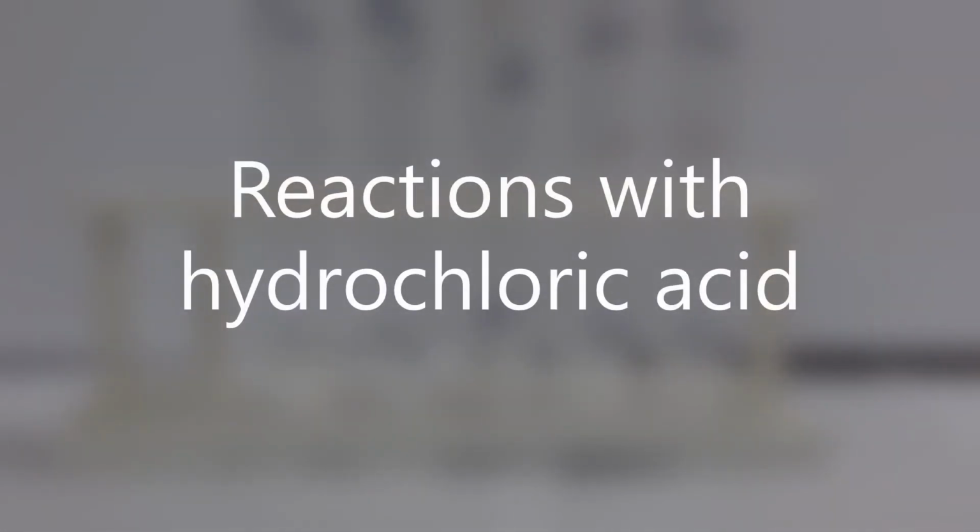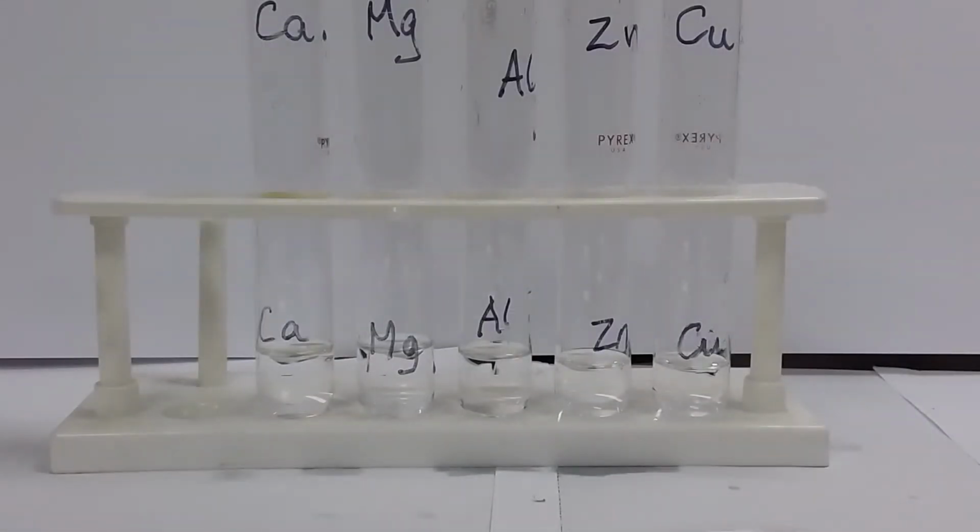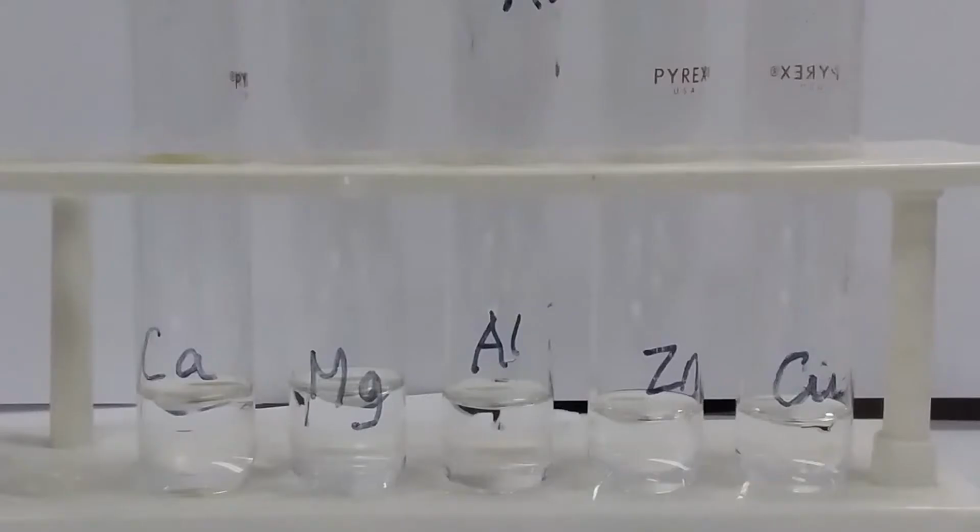So in these boiling tubes, we have some dilute hydrochloric acid, and we're going to do the exact same thing where we add a piece of the metal to the dilute hydrochloric acid. We've not added any indicator because there's no need to do that. So we're going to add the metal to the acid and watch the relative reactivity.